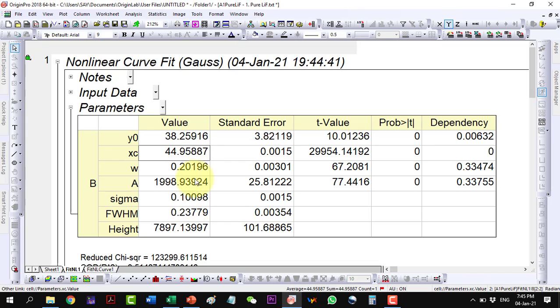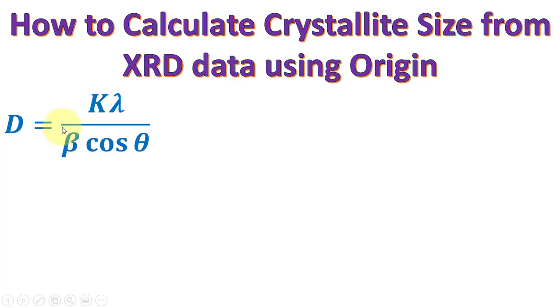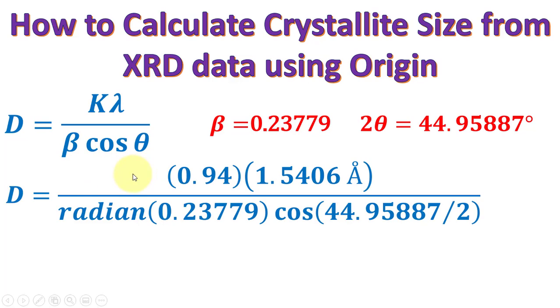Let's go to our calculations. Here is our Scherrer equation. The value of beta is 0.23779 and the two theta value is this one. Let's put this in the equation.